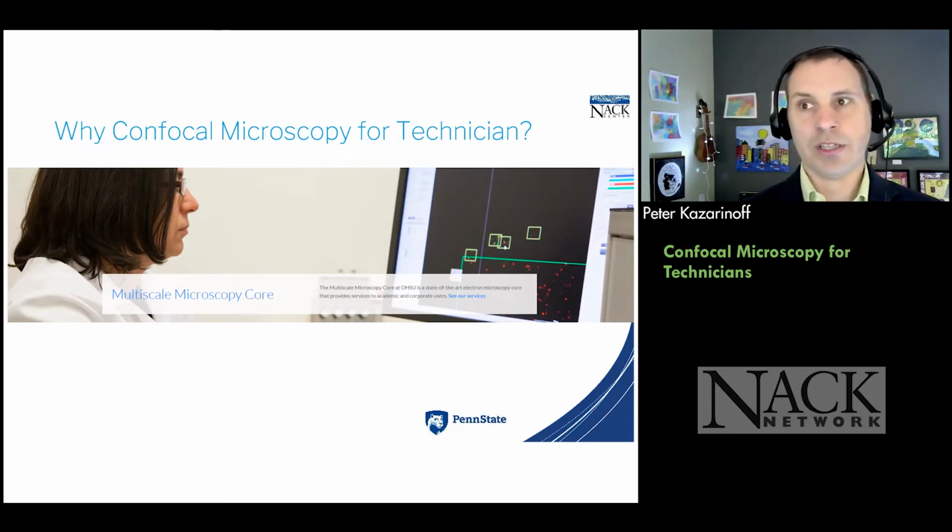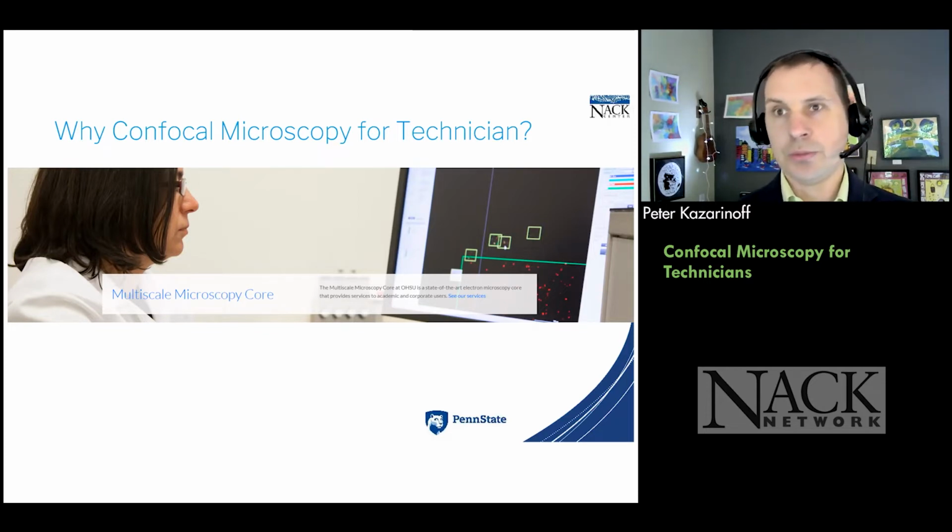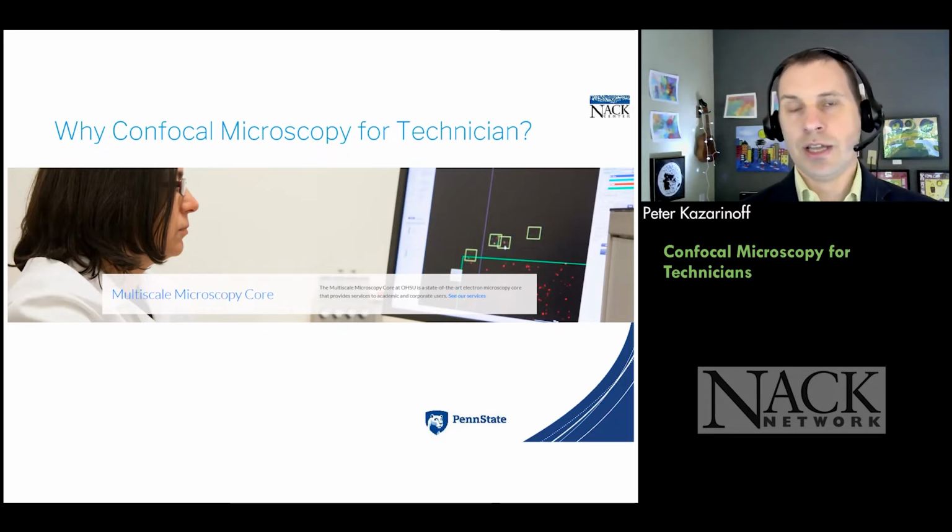But those same facilities also often have laser scanning confocal microscopes. And if a student can use an SEM or a TEM, it requires some additional training to level them up to use a confocal microscope, but there are a lot of concepts in common with SEMs and AFMs.